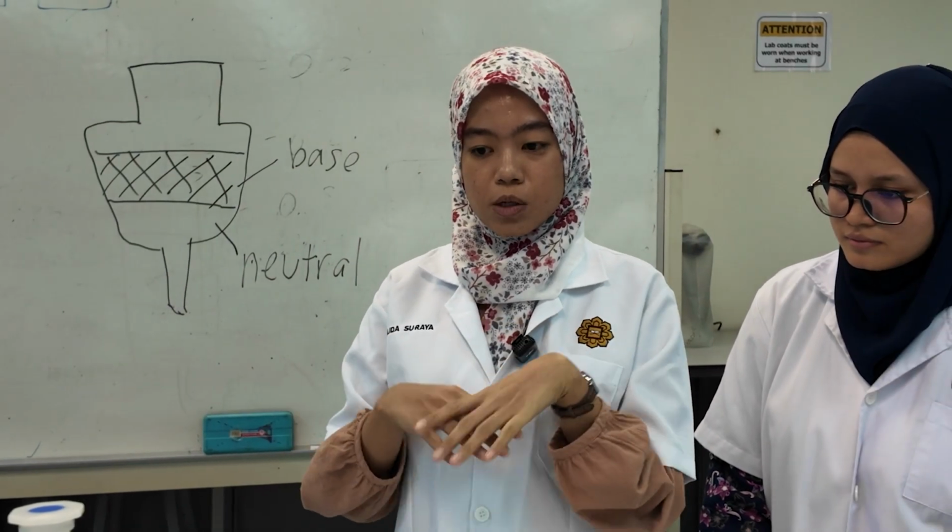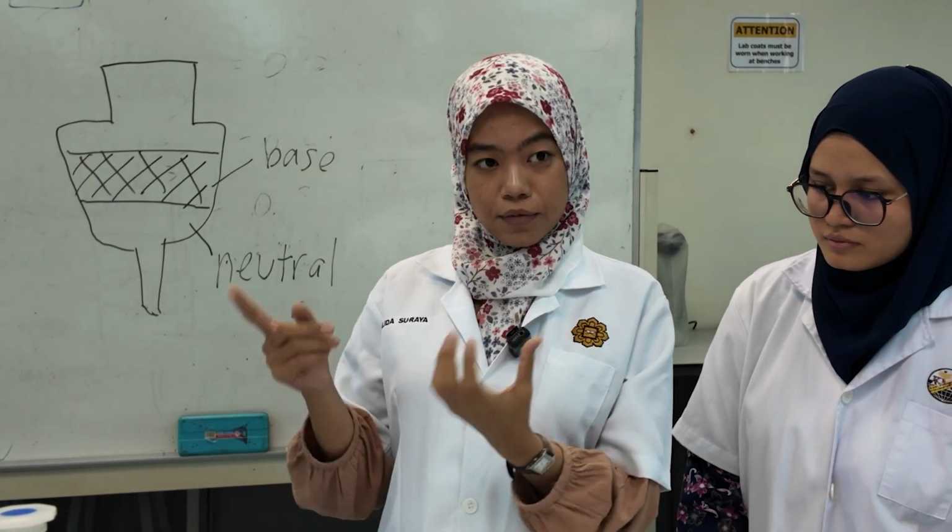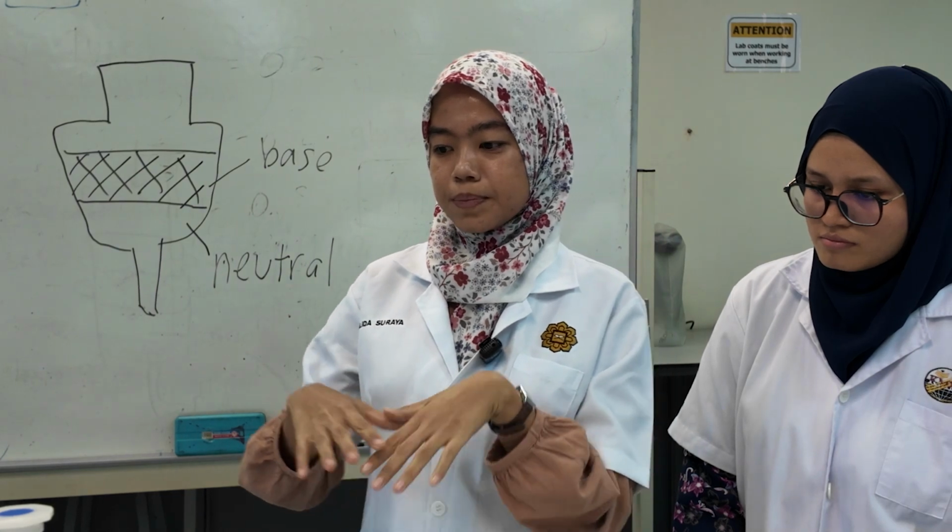The coffee beans will be soaked, and the caffeine will be dissolved in the solvent. Dichloromethane is immiscible with water, but it can dissolve the caffeine effectively. That's why we choose dichloromethane as the organic solvent. The caffeine diffuses into the water and is then extracted into the organic solvent. So that's how we can still have the coffee bean without the caffeine, the decaffeinated coffee bean.